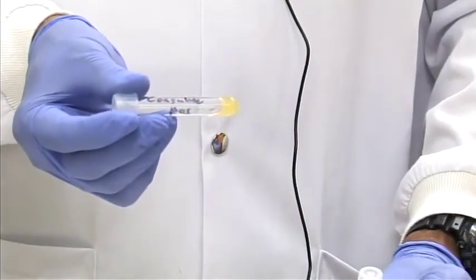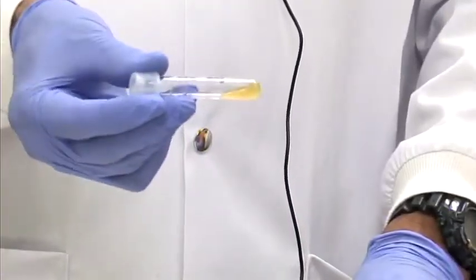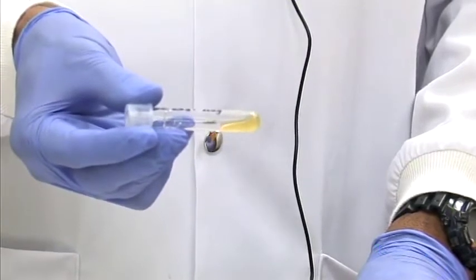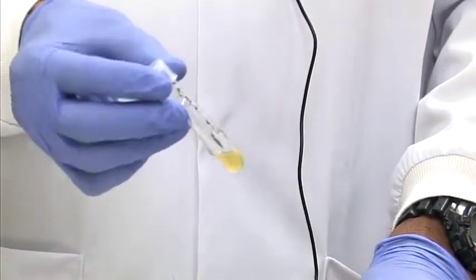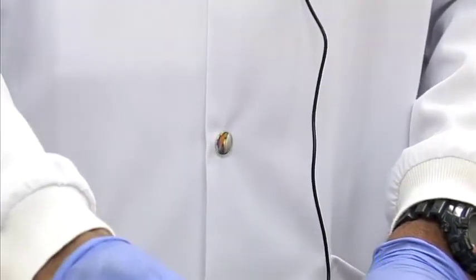That's for Staphylococcus aureus. Staphylococcus epidermidis now, here we have, you can see it's a negative reaction where the plasma did not clot. Again, because of the bacteria not possessing the enzyme coagulase, so we have the plasma remaining in its liquid form. So that's the coagulase test.